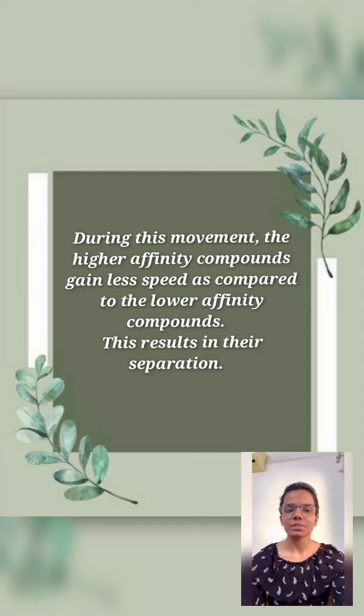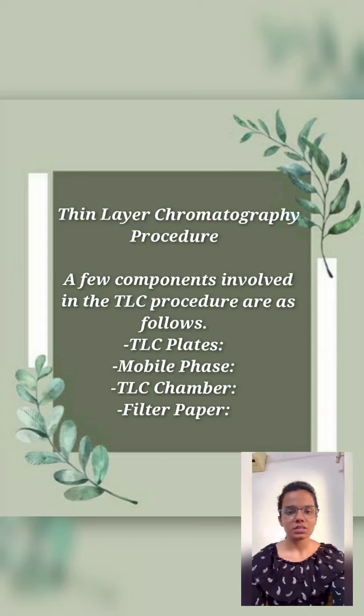After the TLC principle, now let's move on to its procedure. Procedure of thin layer chromatography. From the information mentioned earlier, it must be clear how TLC works. However, we still need to learn about its complete procedure to see its entire functioning. A few components involved in the TLC procedure are as follows.